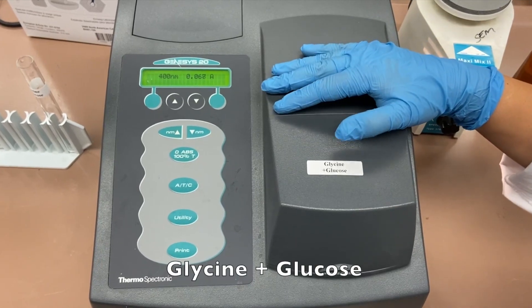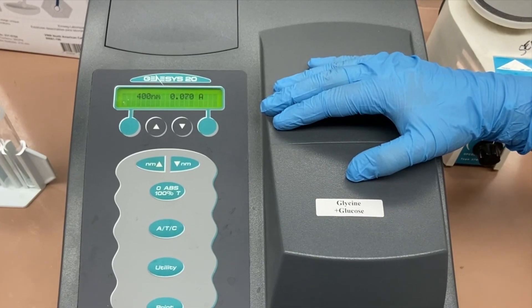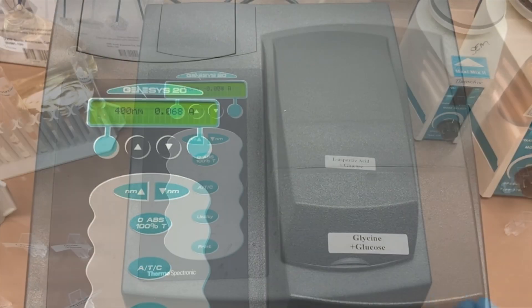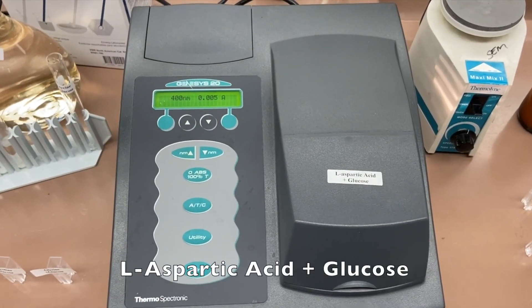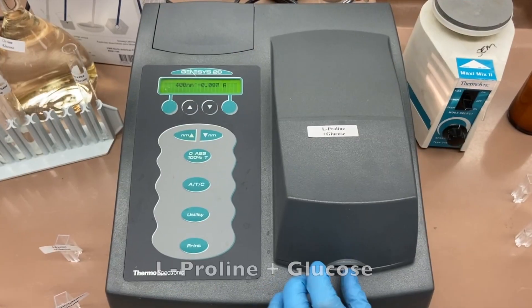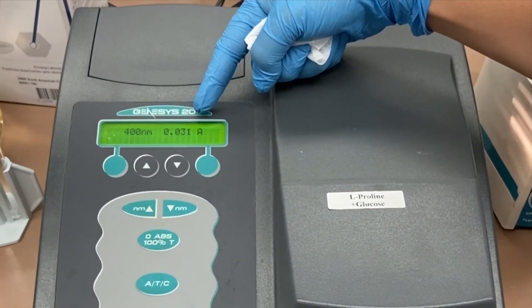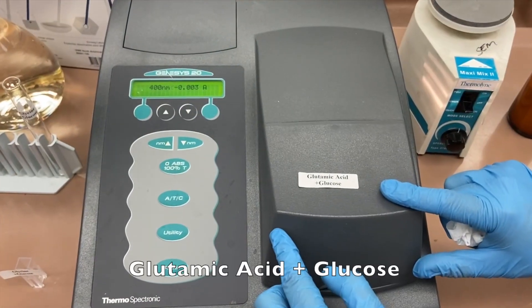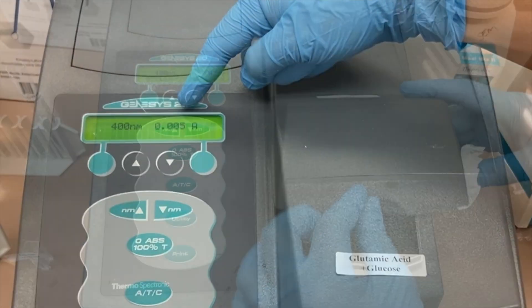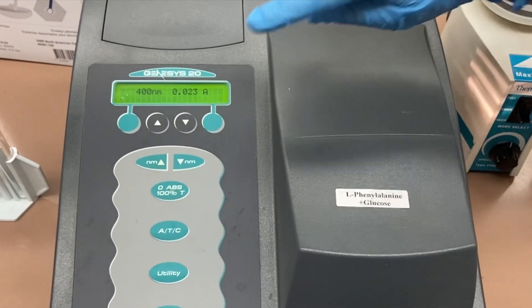Just a reminder that glycine and lysine were diluted with 1000 ml of DI water. This is the reading for glycine, and these are the readings for each remaining sample.